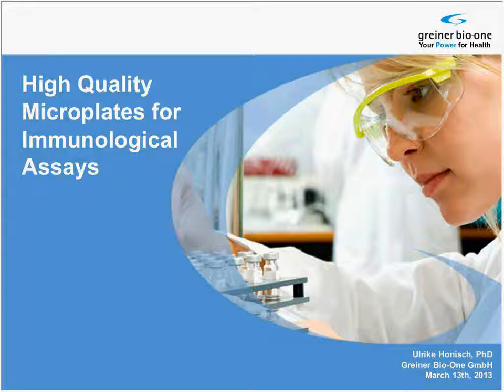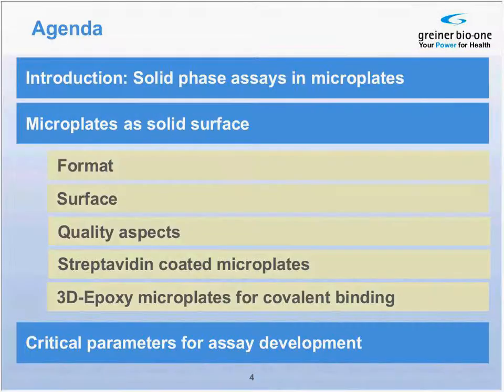Thank you very much, Mackenzie, for this kind introduction. And welcome to everybody as well from my side to today's webinar with the title High Quality Microplates for Immunological Assays. I start with a short introduction about assays in microplates and switch to the main focus of this webinar, properties and quality aspects of microplates used for immunoassays. I will end my presentation with some remarks about critical parameters for assay development.